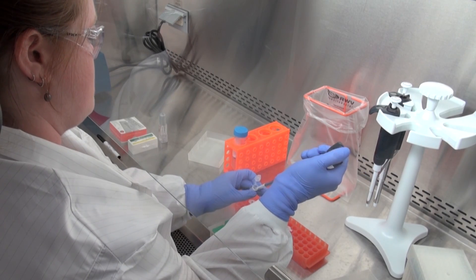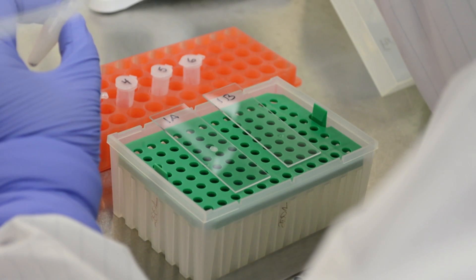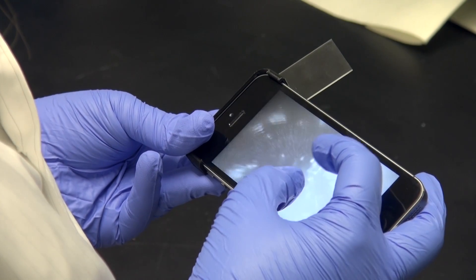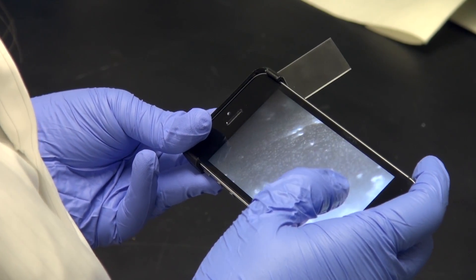PNNL researchers working in national security were looking to develop a tool for first responders, say when a suspicious white powder is discovered. So the HAZMAT team would arrive at the scene and they could take a little bit of the sample, put it in a Ziploc bag, and then use the microscope to image right through that bag.